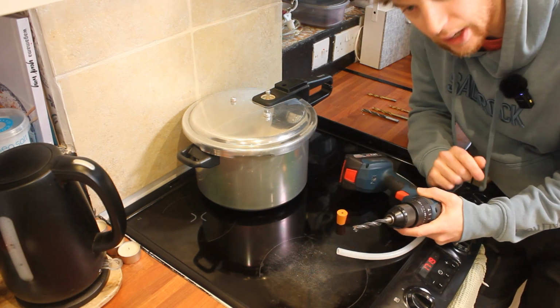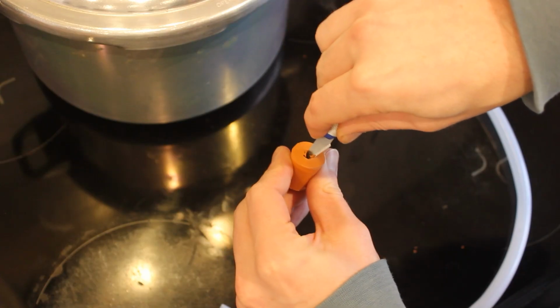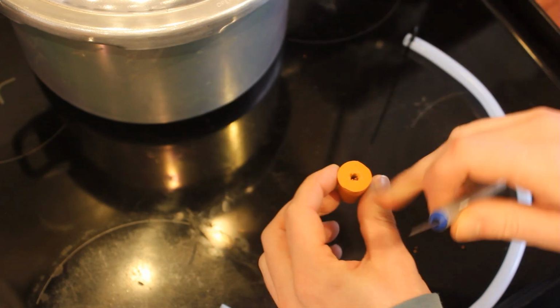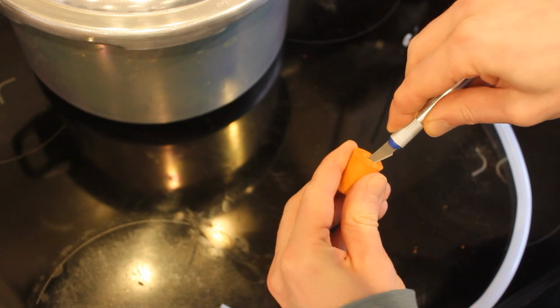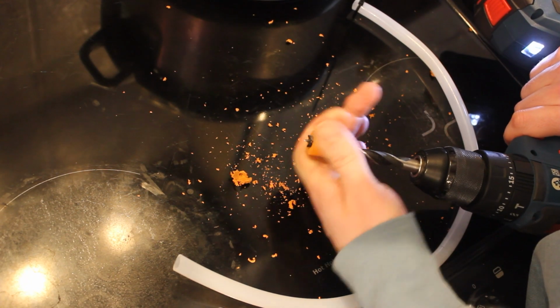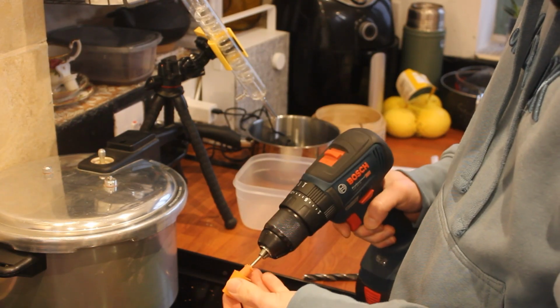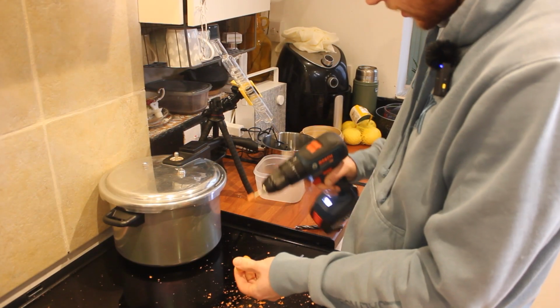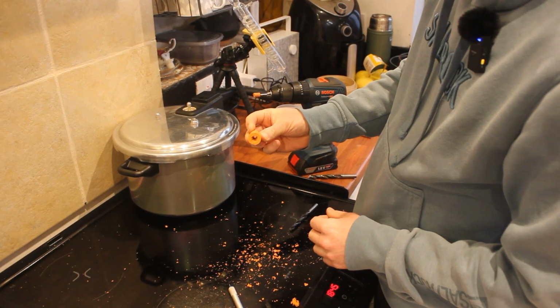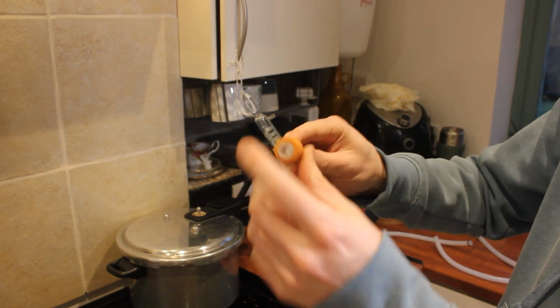Drilling rubber, bad idea, don't try that. Got myself a scalpel. I've only got one of these bungs, so hoping I don't mess it up. Now I've got this little grinding bit on the drill. And we're hacking our way. So now the tube will go all the way through the bung, and there's a nice open hole.